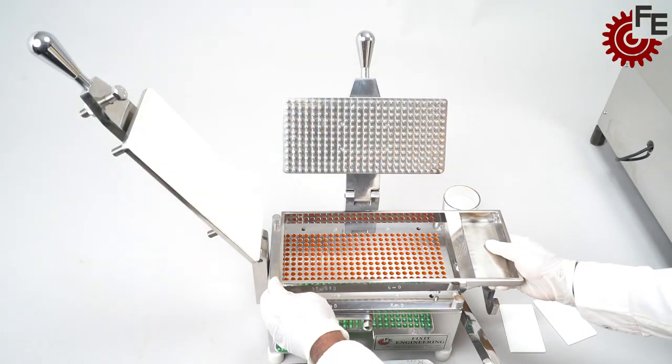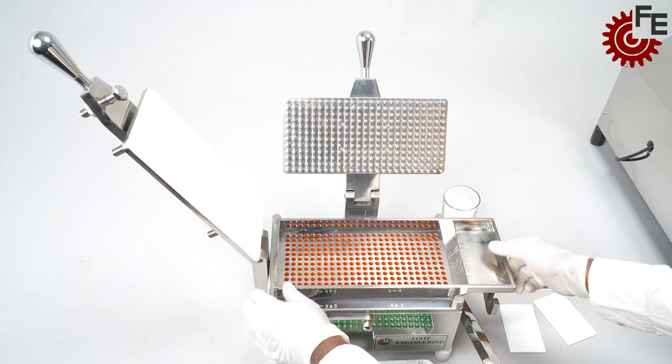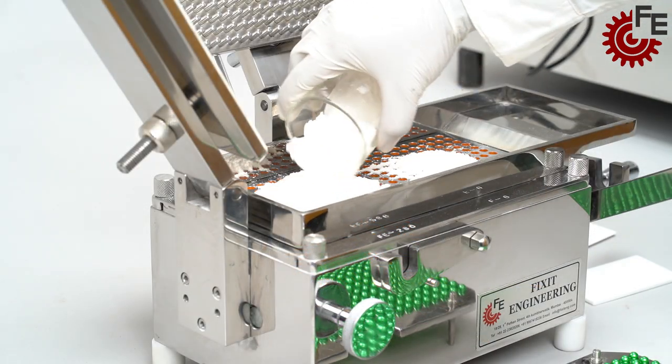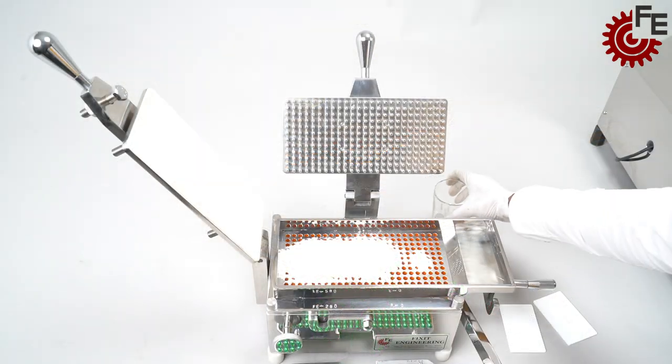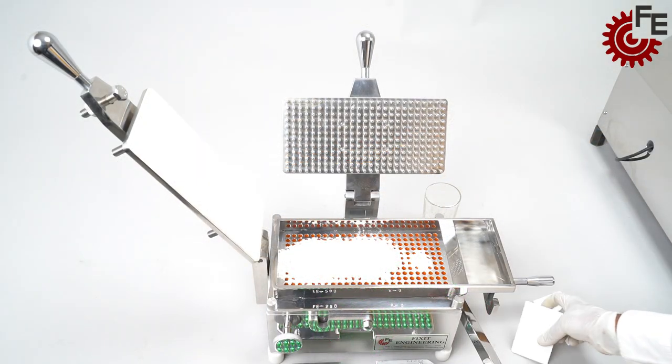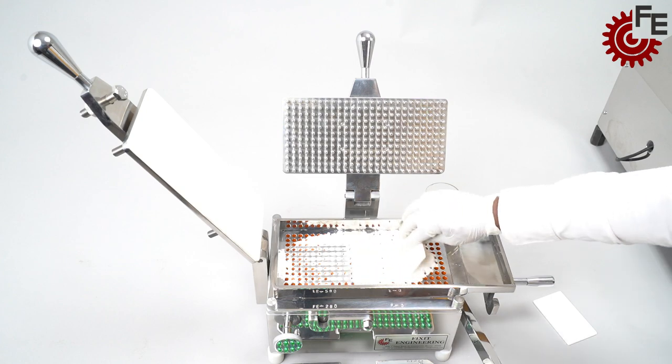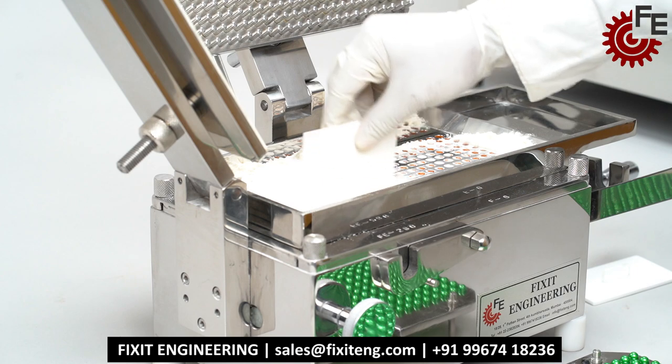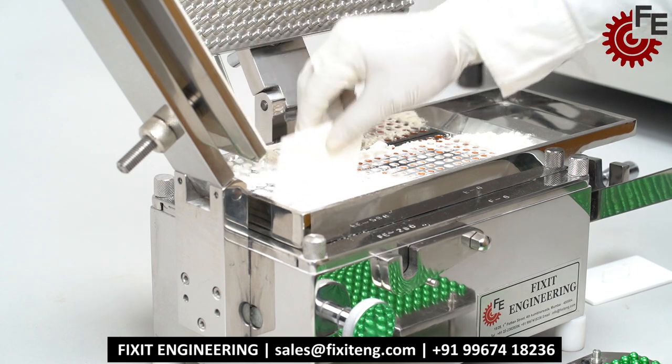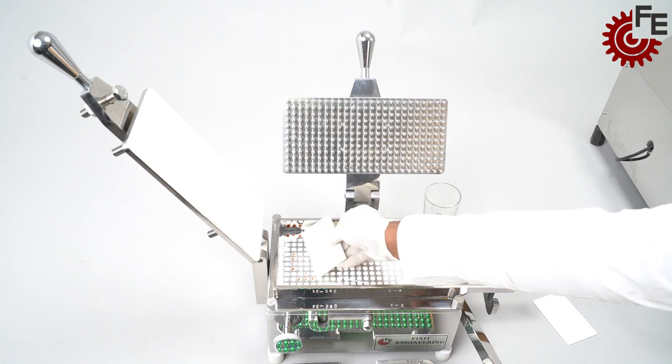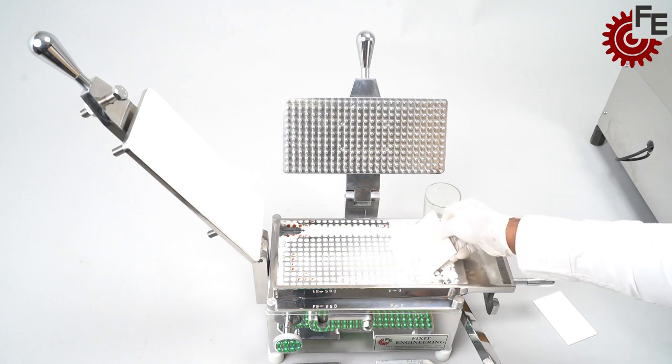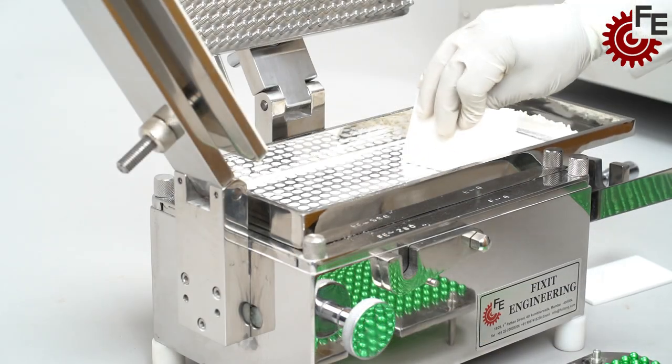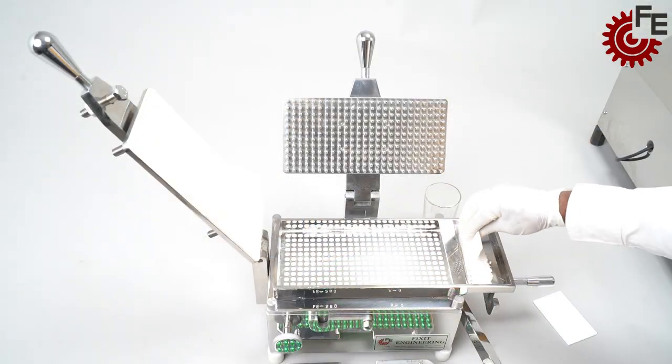Put the powder sprayer tray. Add measured quantity of powder. Spread powder across the tray using scraper. Excess powder can be scraped back on the guard.